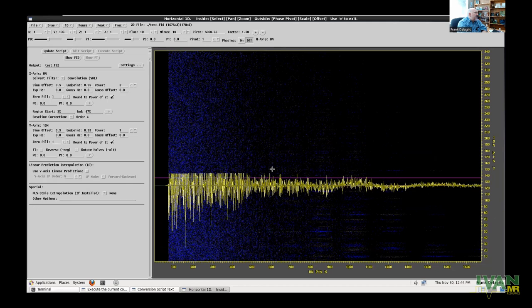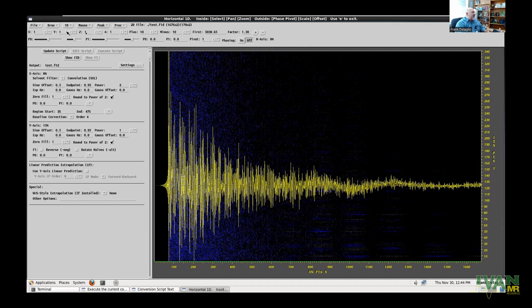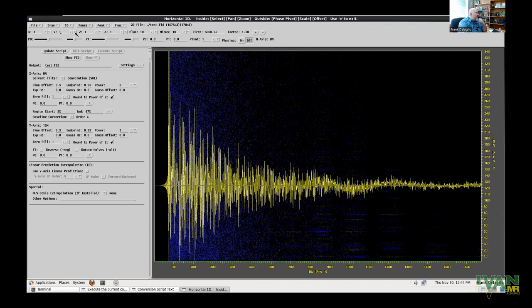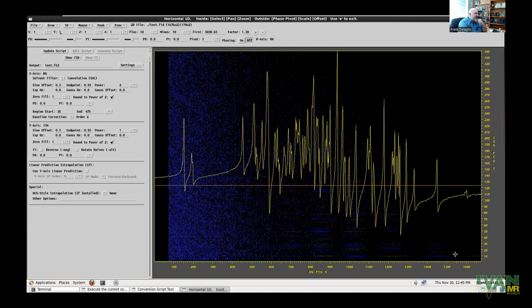And now if I want to, I can type with the keyboard and go to a particular slice, like slice number one, or I can use the caret buttons to increment or decrement the slice number. And we'll see other kinds of slice viewing later. Now, we can do different kinds of interactive processing. We'll see that under the processing window, there are things that will let us execute individual NMRPipe processing functions, or to execute predefined processing functions that will convert the spectral data into a spectrum, and we'll see examples of interactive phasing. But instead of doing any of that, let's go directly to this processing interface, and this is going to automatically build processing schemes for our spectral data.